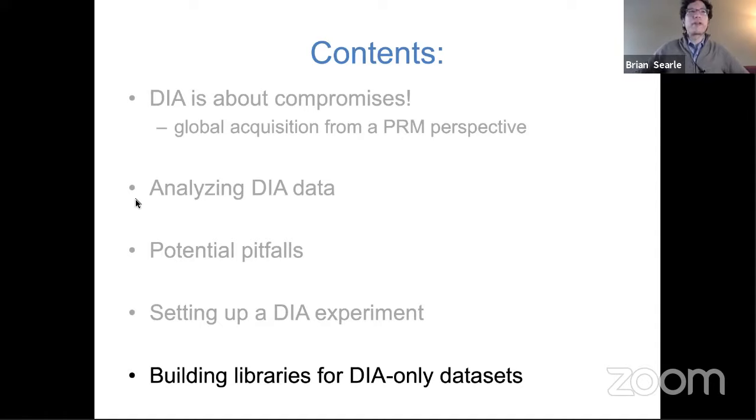I think this is particularly beneficial for Thermo instruments where essentially you're doing centroiding anyway because you're going through the FFT process, as opposed to writing in essentially fake profiles in those types of instruments. That said, there might be some reason to use profiles in certain types of experiments, particularly where you want the most sensitive data analysis, where you might have a specific peptide that you're interested in that you can only see at a very low level, and that won't actually get picked up by the centroiding algorithm. So that is definitely a potential issue. But I personally collect all of my data in centroid mode, for both fragment ions and precursors.